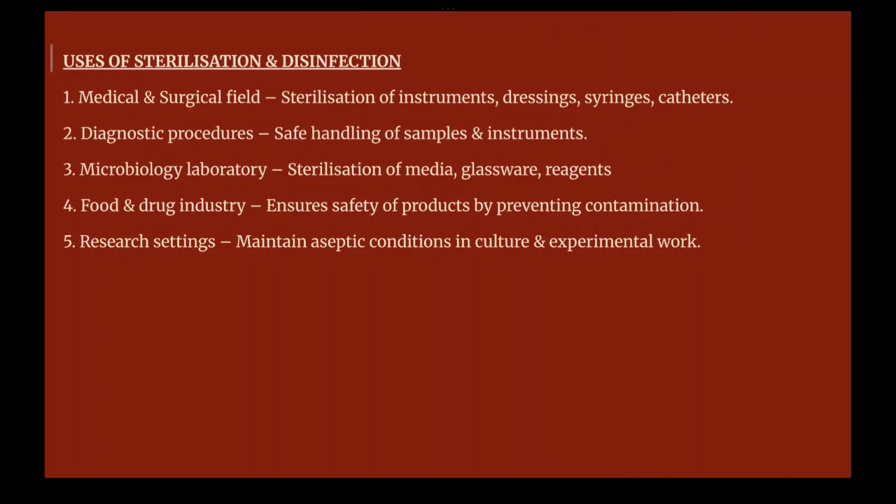The use of sterilization and disinfection. In medical and surgical fields, sterilization is essential and is performed for the instruments, the dressings, the syringes and catheters that are used in the surgical field. Diagnostic procedures involve safe handling of samples and instruments, so sterilization and disinfection can be done in diagnostic procedures where you need to handle the samples and instruments.